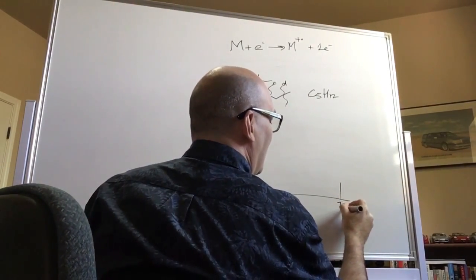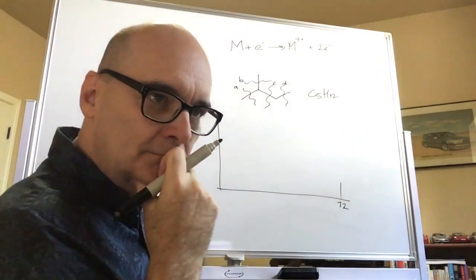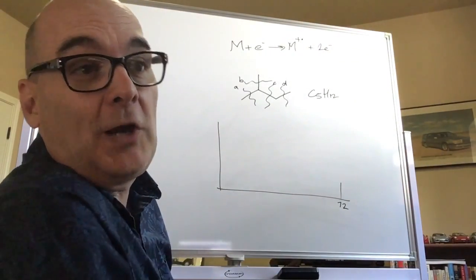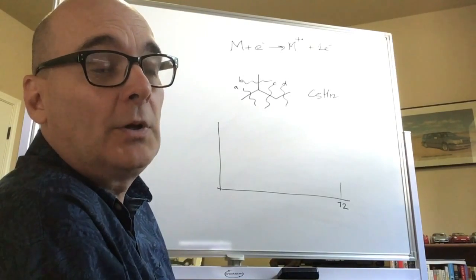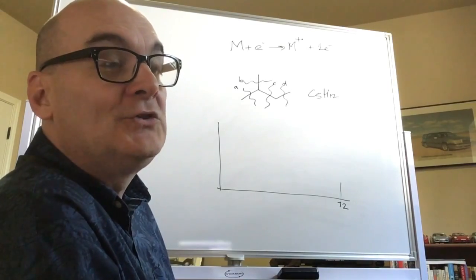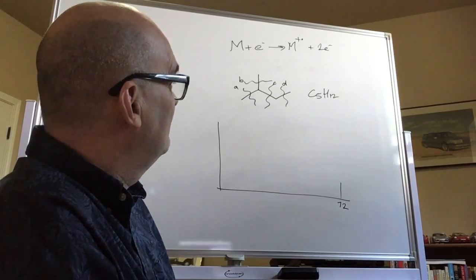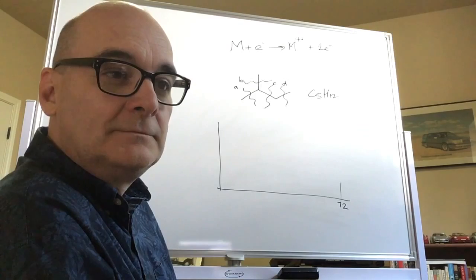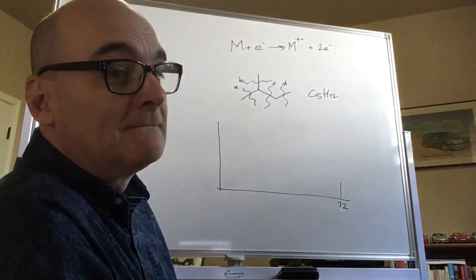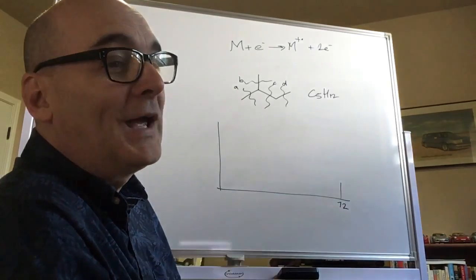So my molecular ion is still at 72. But my base peak, there's going to be a very, very definite base peak in this molecule. One of these fragments is going to dominate over the others. Which one? Won't the tertiary carbocation appear the most? Yes. So, well, do I have a tertiary carbocation?